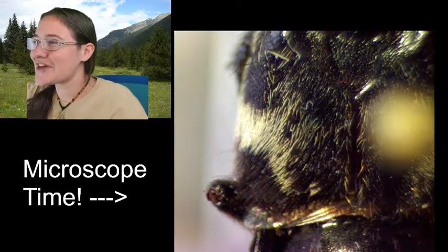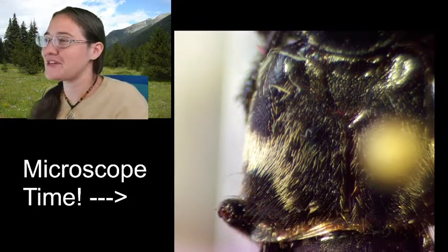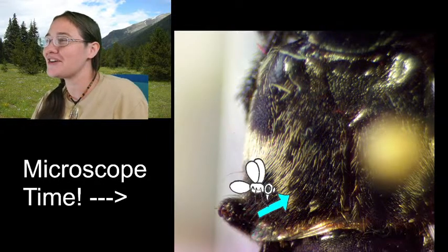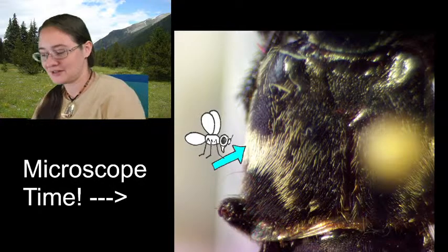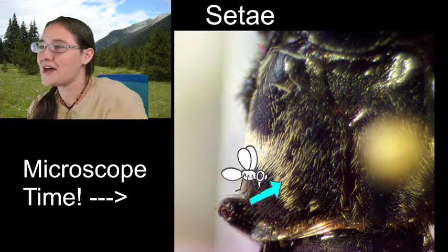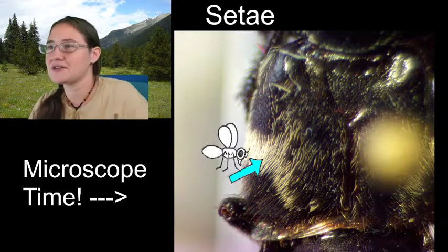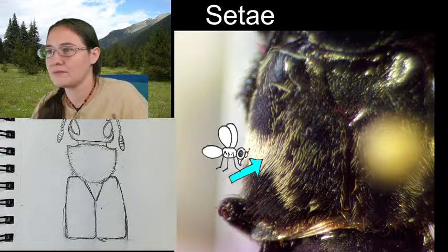No problem. So I wanted to zoom in and check out some of this really beautiful texture on my rove beetle. You can see that he has patches in areas that don't have hair, and he's got patches of long, beautiful golden hair. So if you look right about here, you can see all those beautiful golden insect hairs. We call insect hair setae. Alright, so that's what we call our insect hair that you can see here. It's beautiful. I'm going to make sure that I'm getting my sketch taken care of, and I'm going to go ahead and give some of these hairs the USB cam. There it is.